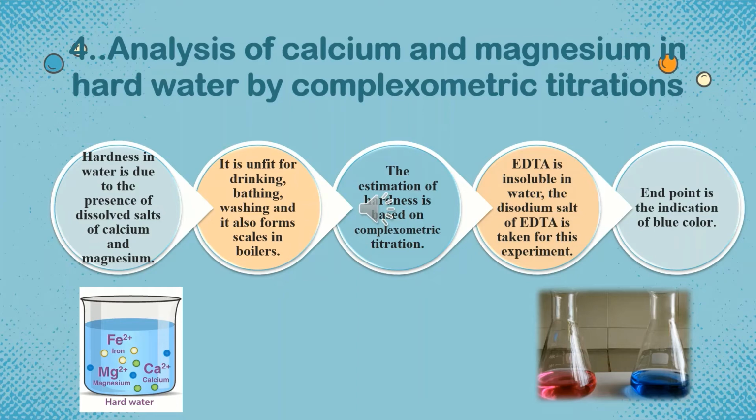EDTA is insoluble in the water. The disodium salt of the EDTA is taken for this experiment. The endpoint is indicated by the blue color.